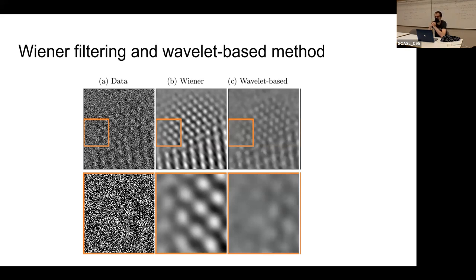Actually, maybe it's useful to say what's the number of pixels in these images, Shreyas? So one frame is close to 1,200 by 1,200. So it's more than a million pixels per frame. If you remember, if you just set it as a giant linear regression problem, it's going to be insane. The number of parameters is 1 million times 1 million. So no way you can do this. However, as we discussed, there's going to be some translation invariant structure, so I can maybe fit a linear translation invariant model, and that would be a Wiener filter.